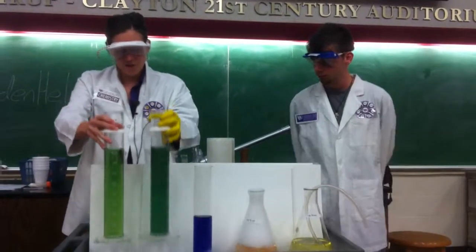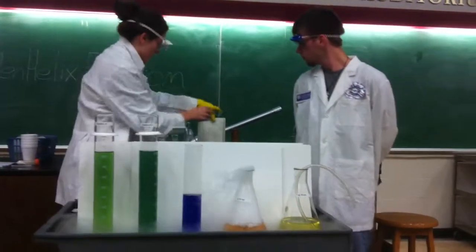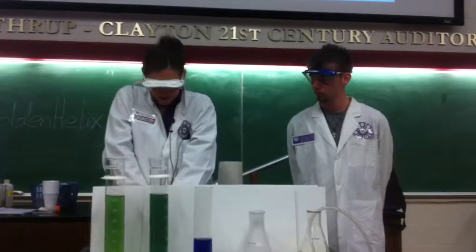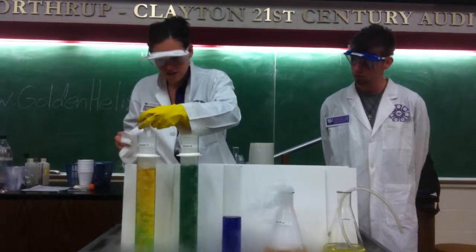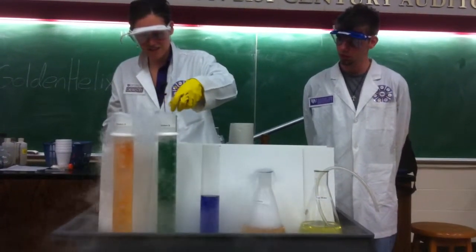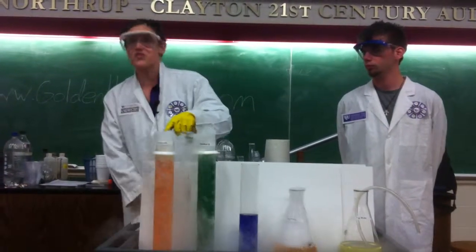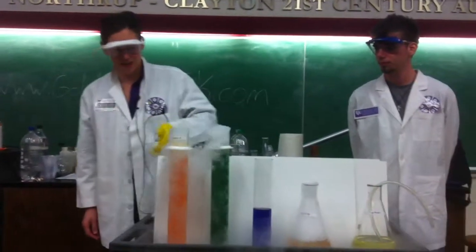So now here what I have are two other solutions. I have a solution A and a solution B. And what we're going to do is add some dry ice to both of them. Make observations. So can you all see these two? What's happening? This one, same observation that we saw here, this is just tap water. I add tap water, I put my dry ice, which is our solid carbon dioxide. The carbon dioxide reacts with the water to form carbonic acid, the pH drops.